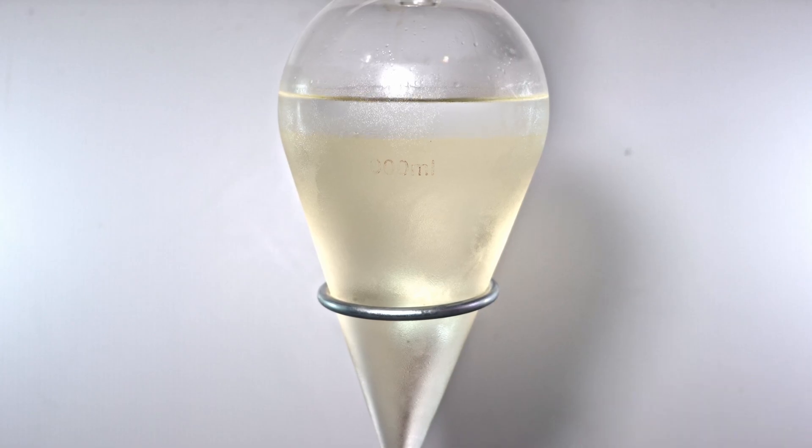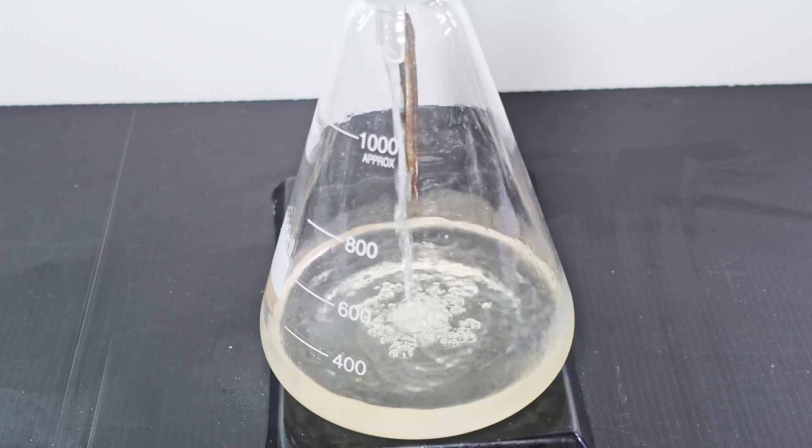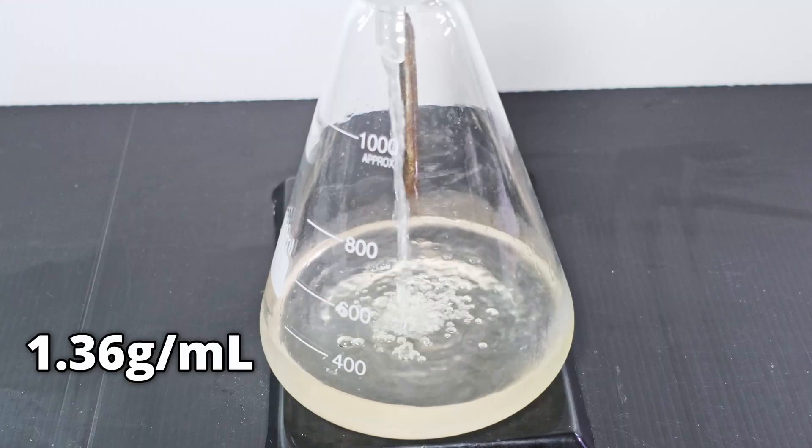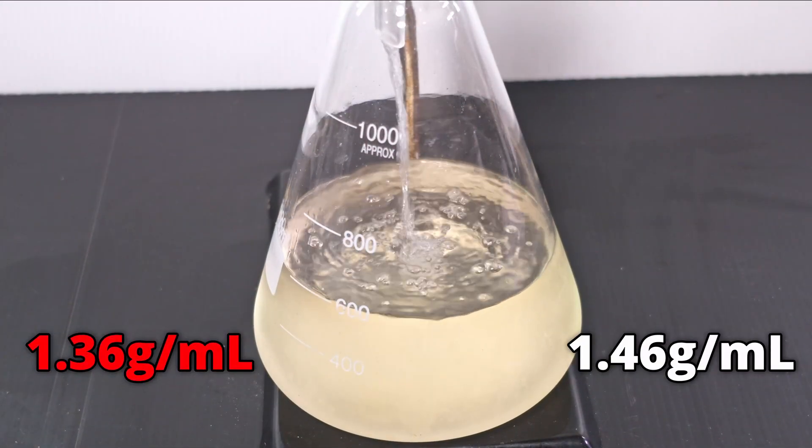I separate the much larger halide layer from the top alcoholic layer. The bottom crude layer is 1.36 grams per milliliter, a far cry from the 1.46 ethyl bromide is noted to be.